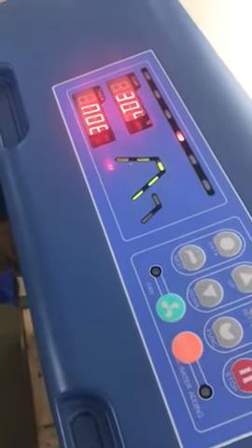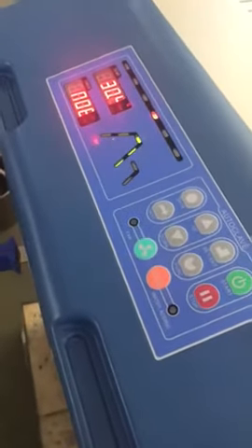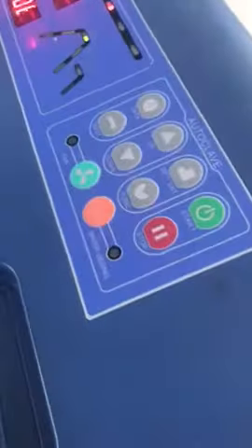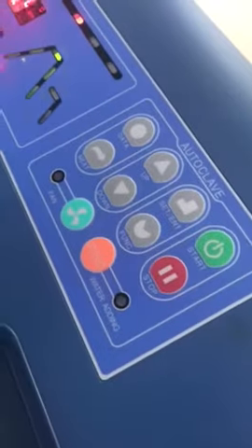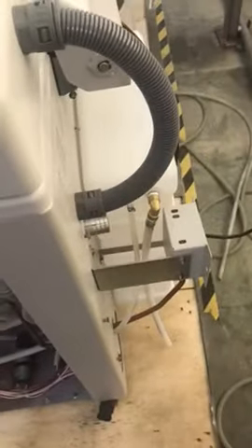When the screen is showing NO8, it means you need to add water into the behind water tank. Connect this water tube into a 30 liter water container, then press the water adding button. The screen will show ADD2, meaning it's adding water from the 30 liter container into the water tank behind, to be used later.